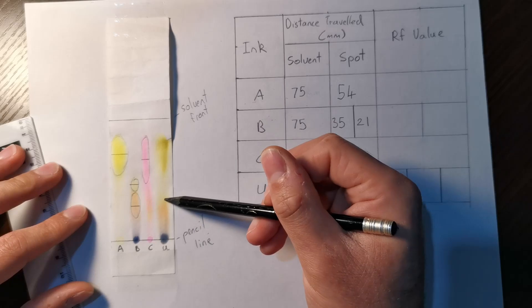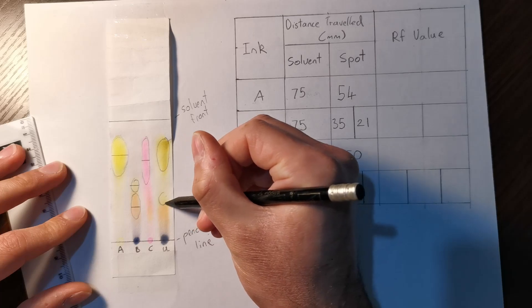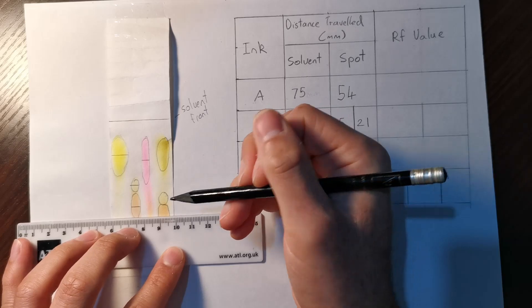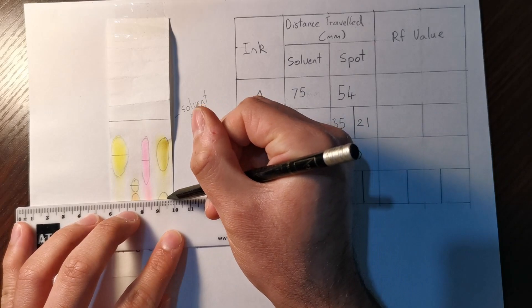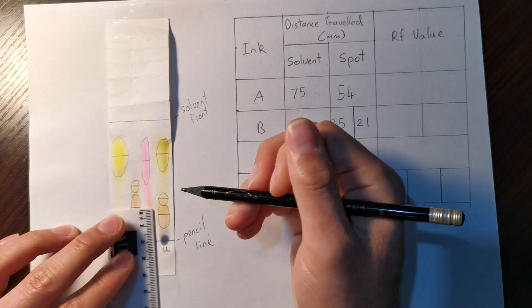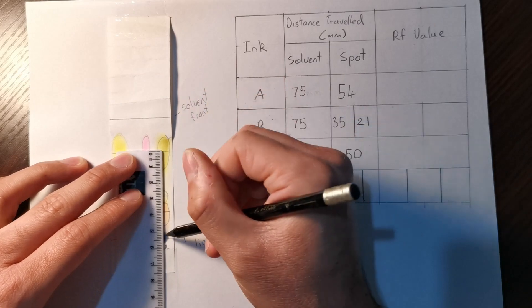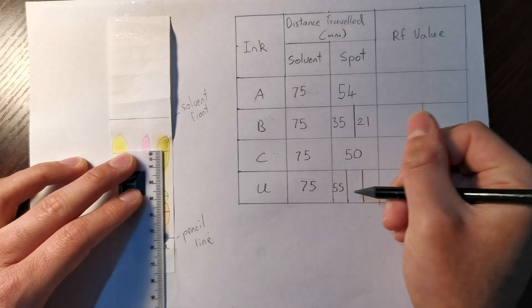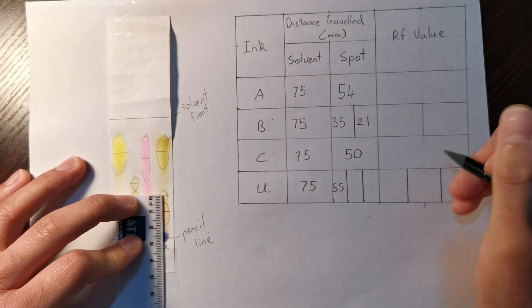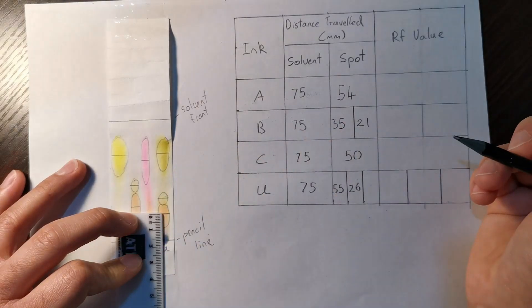The last one, U, is made up of three spots. Draw circles around each — the top one, the middle one, and the orange one at the bottom. Measuring from the middle of each spot down to the pencil line: the top yellow spot is 55 millimeters, the next is 26 millimeters, and the bottom one is 16 millimeters.